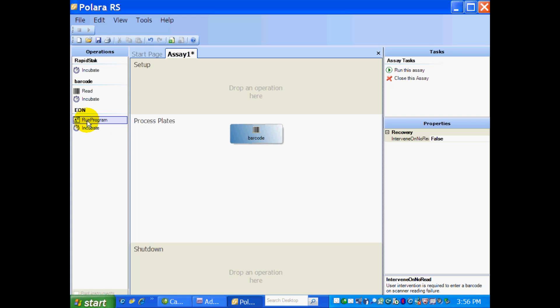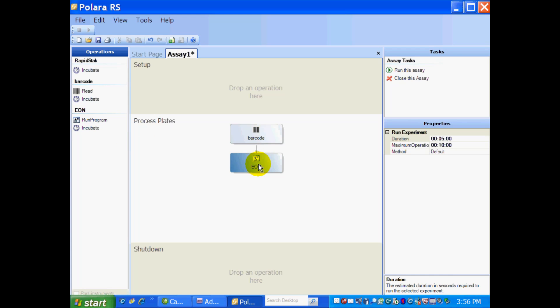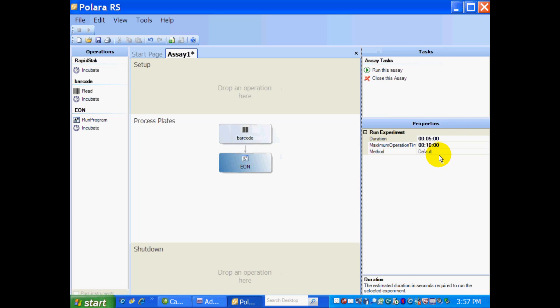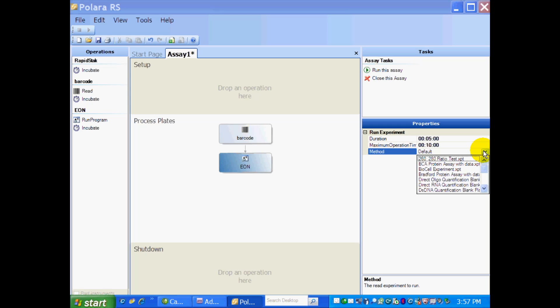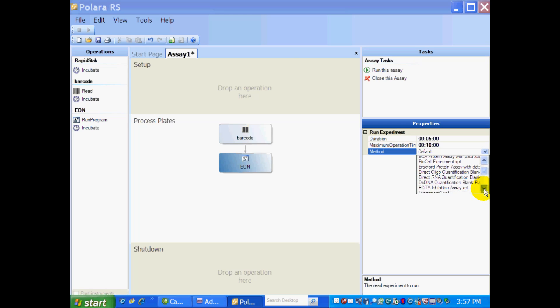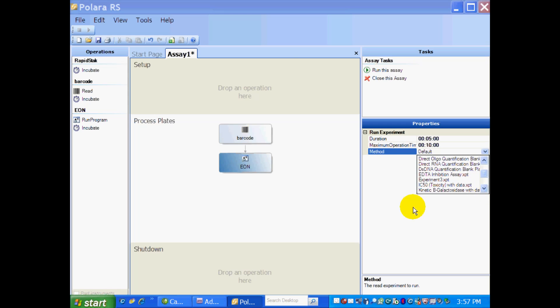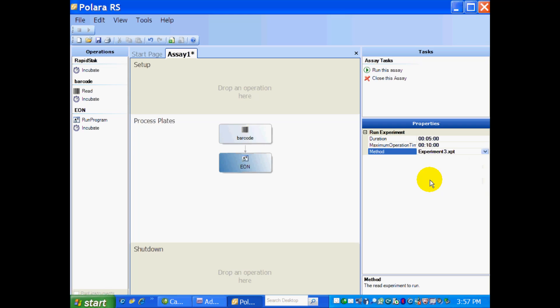Next, I go to my Eon, and I do Run Program. So I drag that in the middle. Again, my Properties becomes active. And so I want to click on there, click on the drop-down arrow. And so now I have a whole series of my experiments that I can choose from that's saved in Gen 5. And I can just pull from there any experiment. So I'm going to hit Experiment 3.